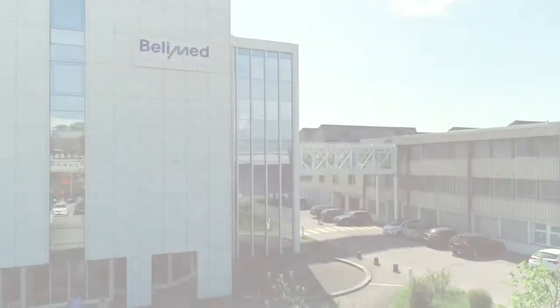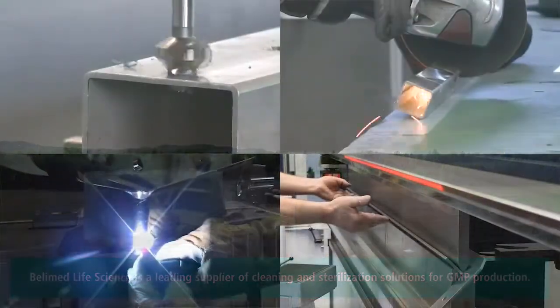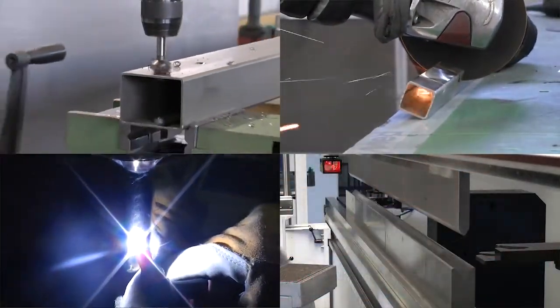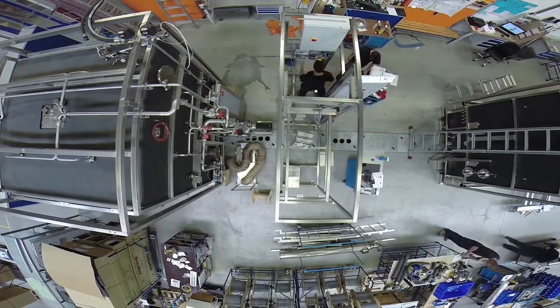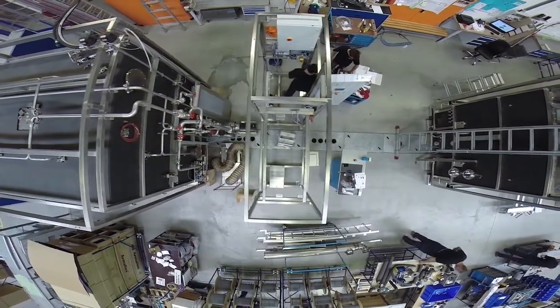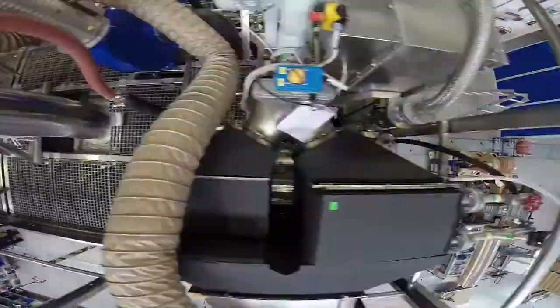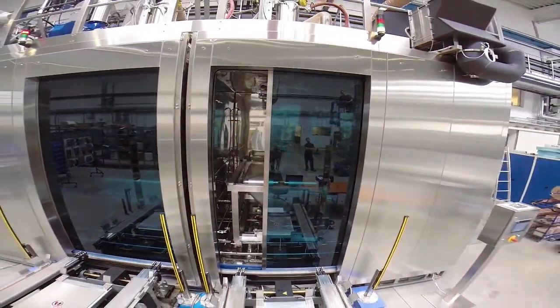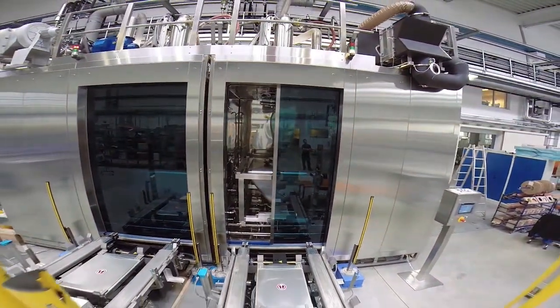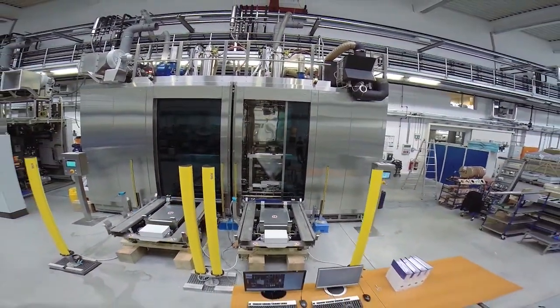BELIMED is a leading supplier of CGMP compliant automated washing solutions. Each machine is assembled to suit the user's requirements in order to meet customer demands for washing and validation processes. The following film will present BELIMED's solution for the washing of containers with integrated high containment valves, the DPH 880.